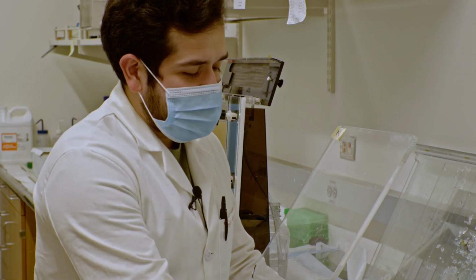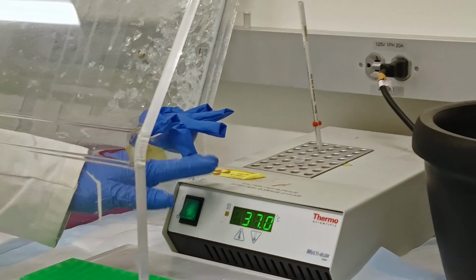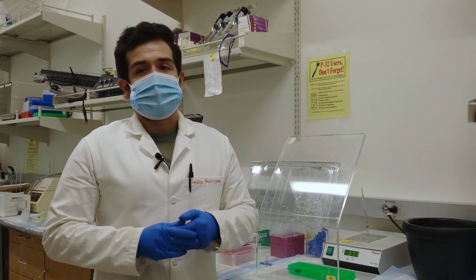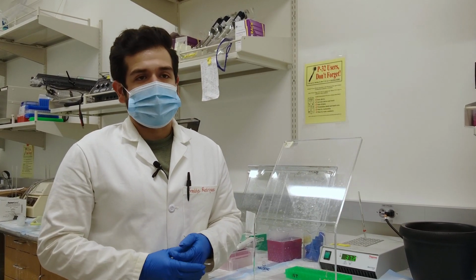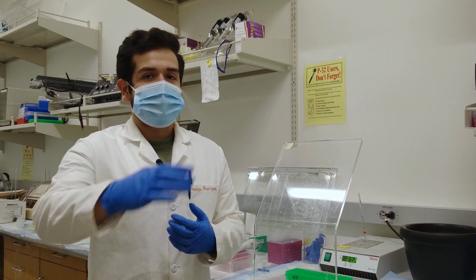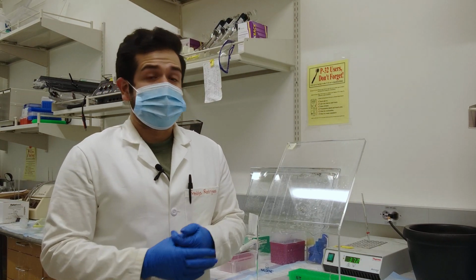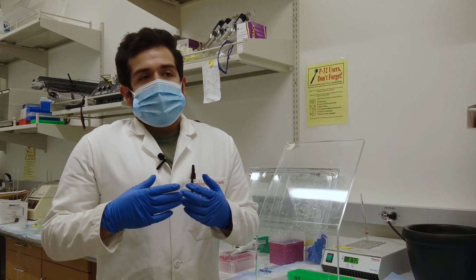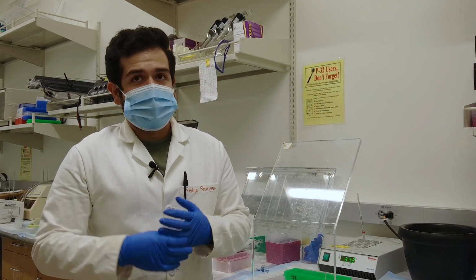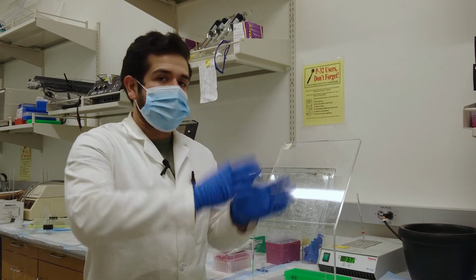You then put that solution on this heat block that's preheated at 37 degrees, and you allow this reaction to occur for 1 hour. So the reaction that's going on right there is being catalyzed by T4 PNK enzyme, or T4 polynucleotide kinase. This enzyme catalyzes the transfer of the terminal or gamma phosphate of ATP onto the 5' end of your DNA primer in this case. When we use radioactive ATP, which has a P32 labeled phosphate at the terminal end, you're transferring that radioactive phosphate group onto the 5' hydroxyl group of the primer strand.